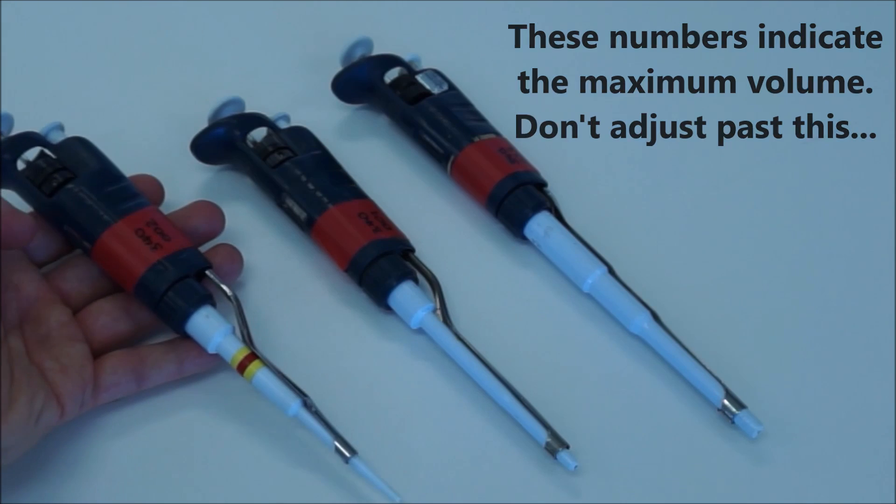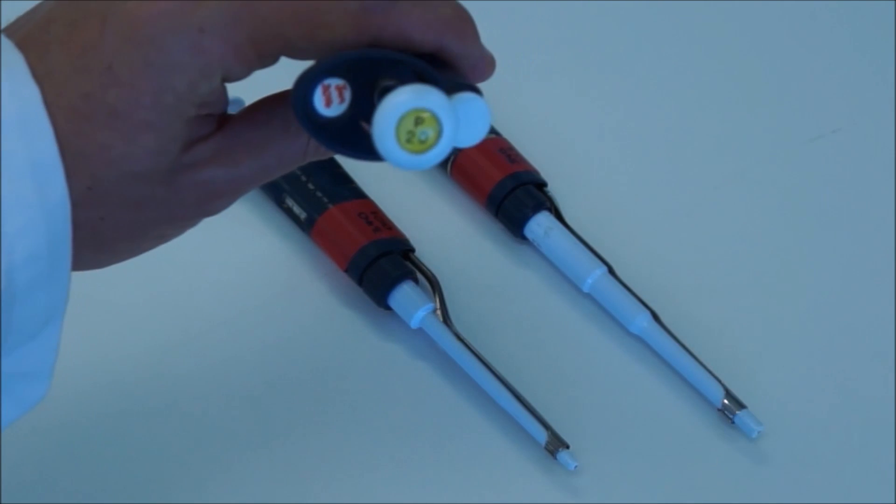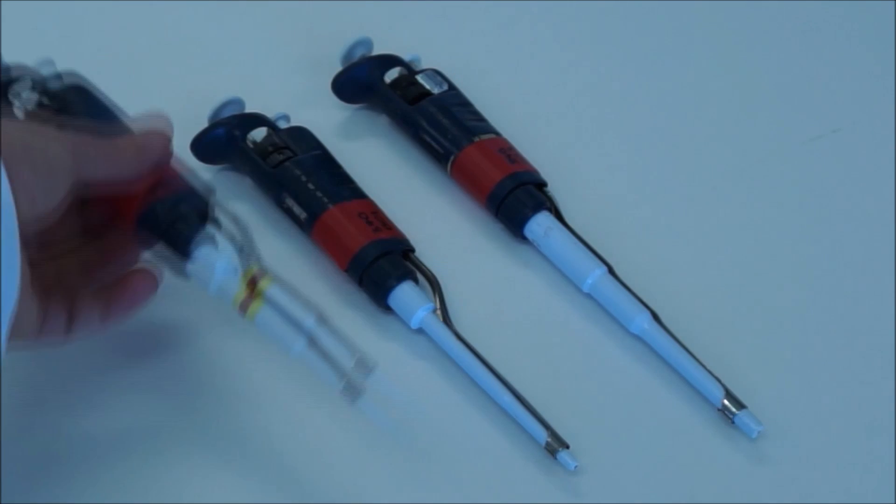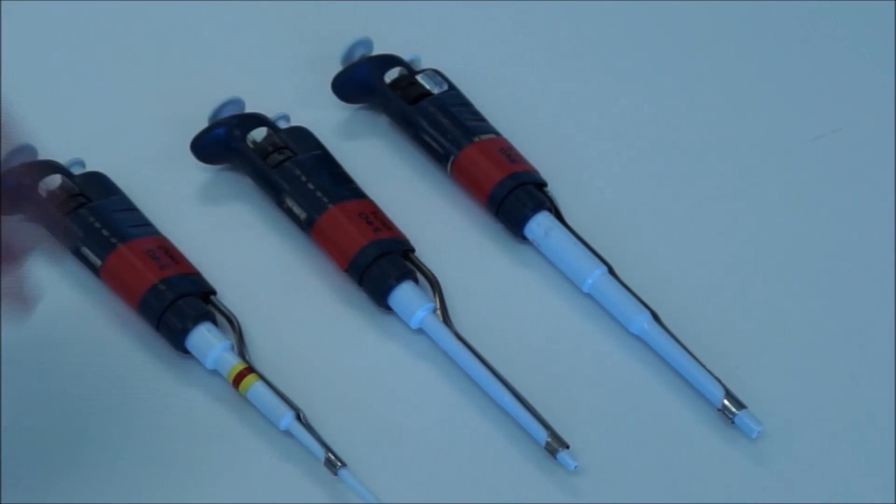I name them P20, 200 and 1000 because that's the maximum volume that you can move around with these pipettes. So this is a P20 because it says it on the end there, P20. And same with the P200 and P1000.